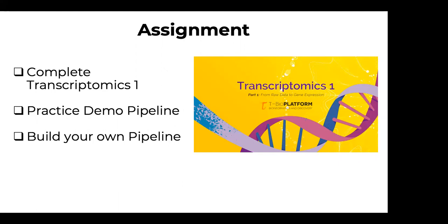In this second assignment, we have another class on Thursday. It would be great if you can finish Transcriptomics, but it is very elaborate and a great course. So I think it would be fine if you can just start with it, go through the things that we discussed today, practice the demo pipeline, and then in the next class, we will teach you how you can build your own pipeline. And that would be really interesting.